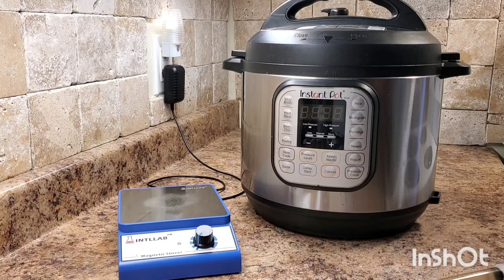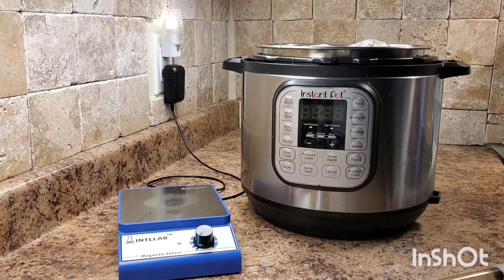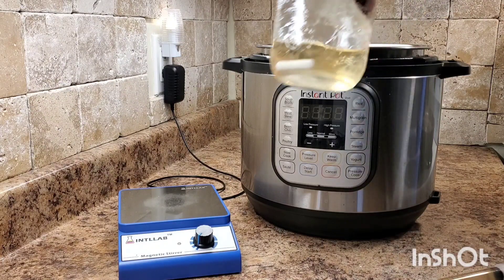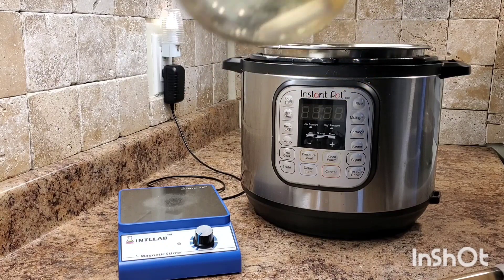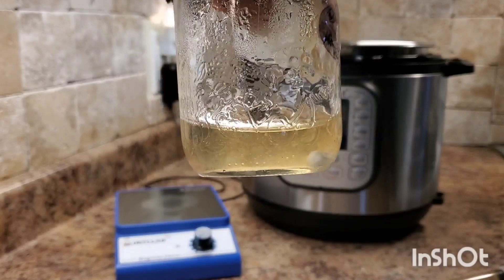Now it's the next day. Our pressure cooker is fully cooled down. We're going to remove the lid, take out our jars and inspect them to see if there are any cracks. Looks good to me. As you can see, all the sugar has been dissolved and we're good to go.